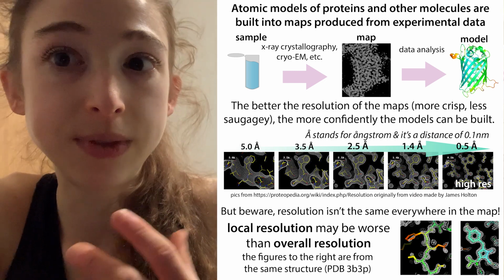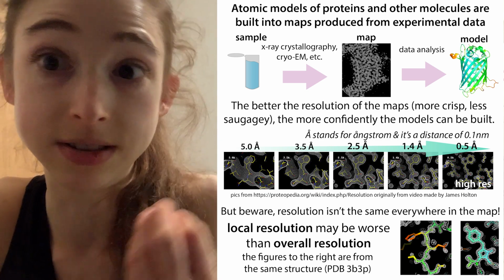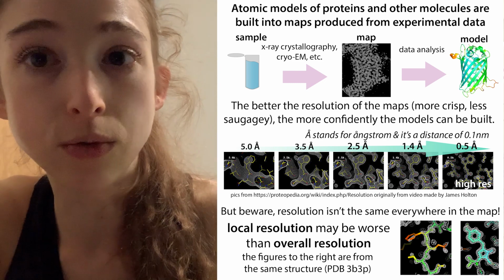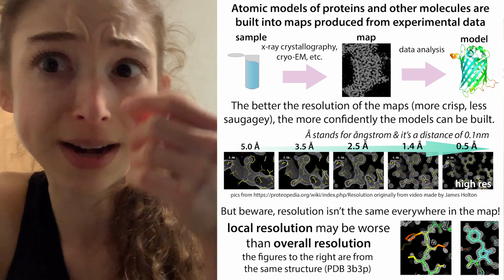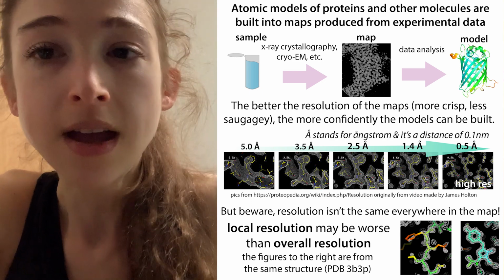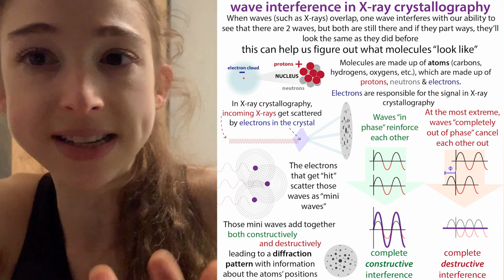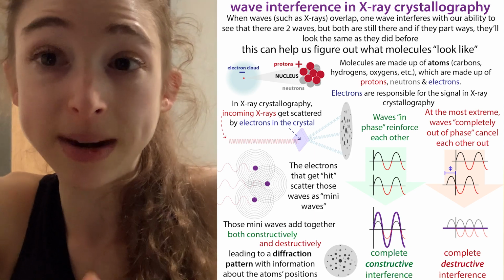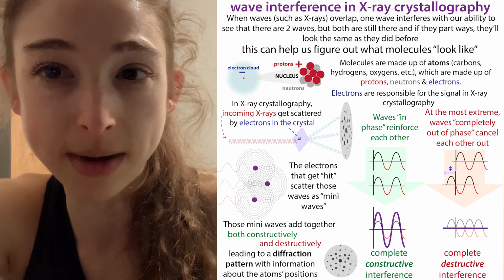Now, of course, you then have to actually go and place those atomic positions in there. And so there's software that can be used in order to do this, but then the scientists really have to go through atom by atom and try to make sure that everything is actually fitting nicely. And this is especially an issue with X-ray crystallography. What happens is that the information you get is missing key information.